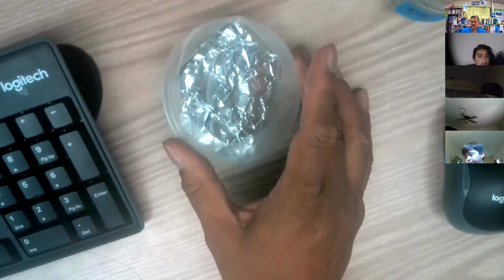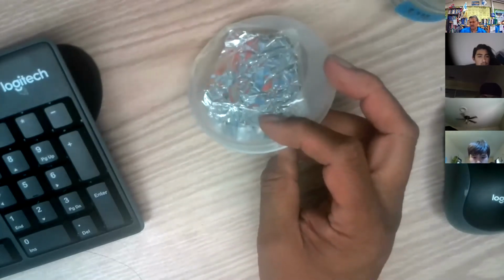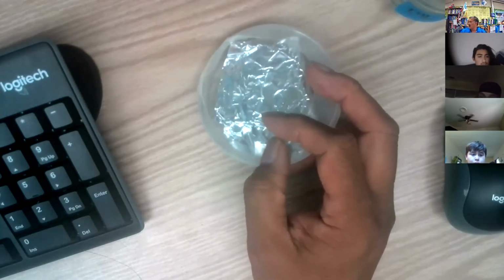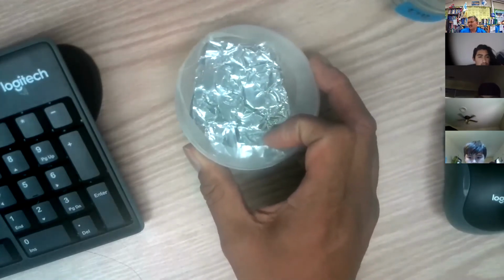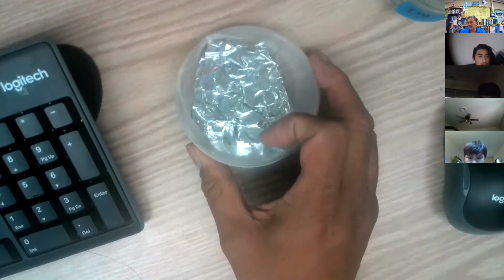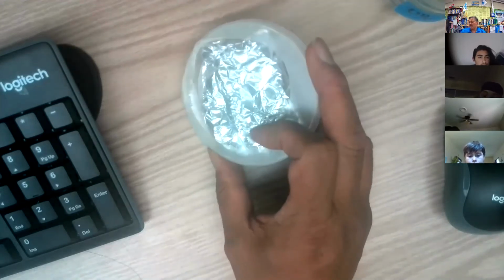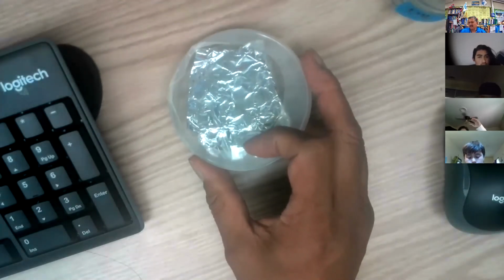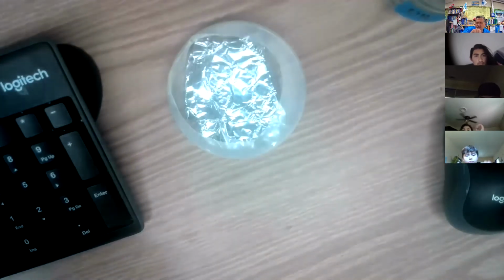That is number 6. Here's number 7. Number 7 is foil. It's too shiny. There's the foil, a piece of aluminum foil in this petri dish. It has certain characteristics. What kind of foil is this? It's aluminum foil. Is aluminum something found in the periodic table of elements? So, with hand signals, is aluminum an element, a compound, or a mixture? Are you ready? 1, 2, 3, show it.